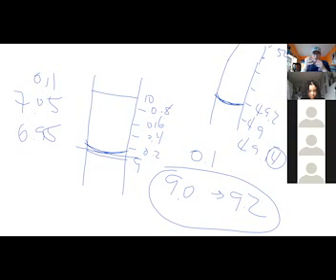It's just, how confident are you that that 7 mL is exactly on the line? Maybe it's a little bit less, maybe it's a little bit more. But if it's exactly on it, and there are no bubbles and nothing else, then maybe your confidence interval goes down even more. So you really have to look at it. I can't tell you what your estimate's going to be. Everyone's is going to be slightly different.